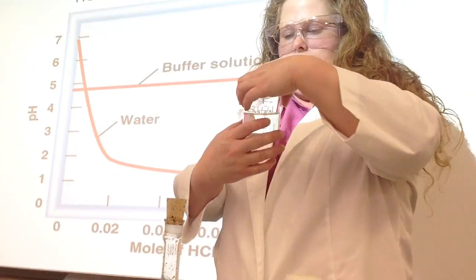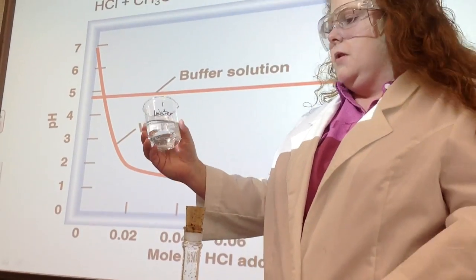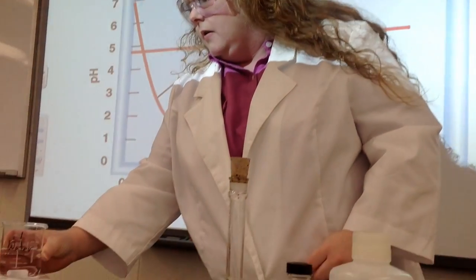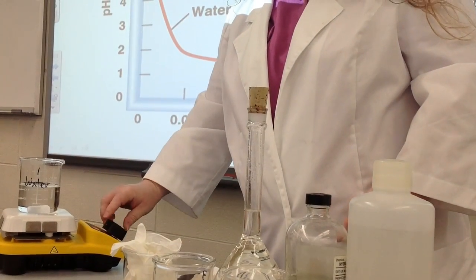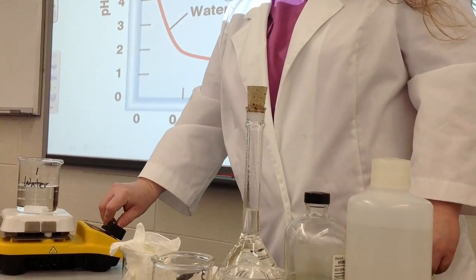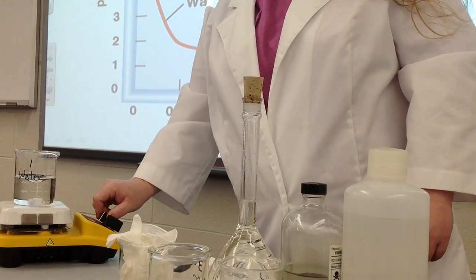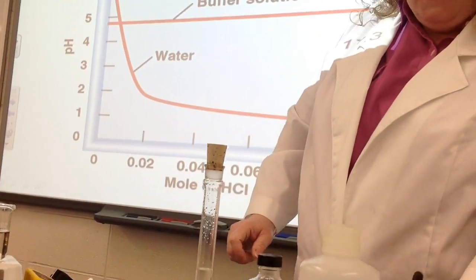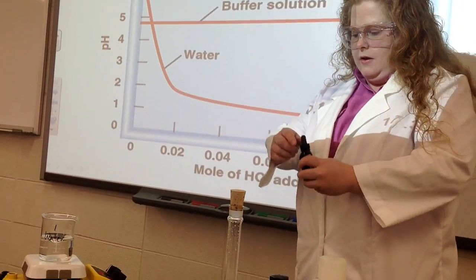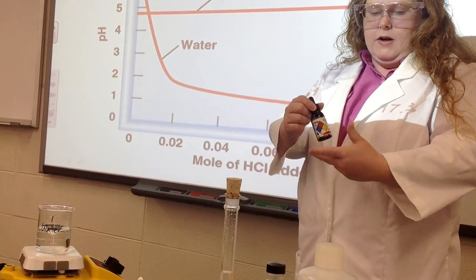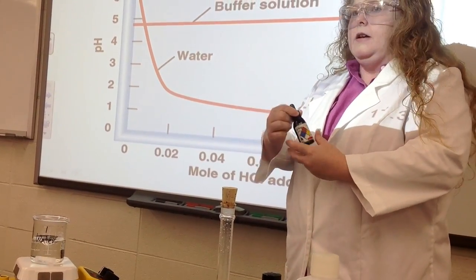All right, so in beaker one I just have some pure water and I'll go ahead and start it stirring. What I'm going to add before we add anything like any of the HCl, I'm going to add an indicator.